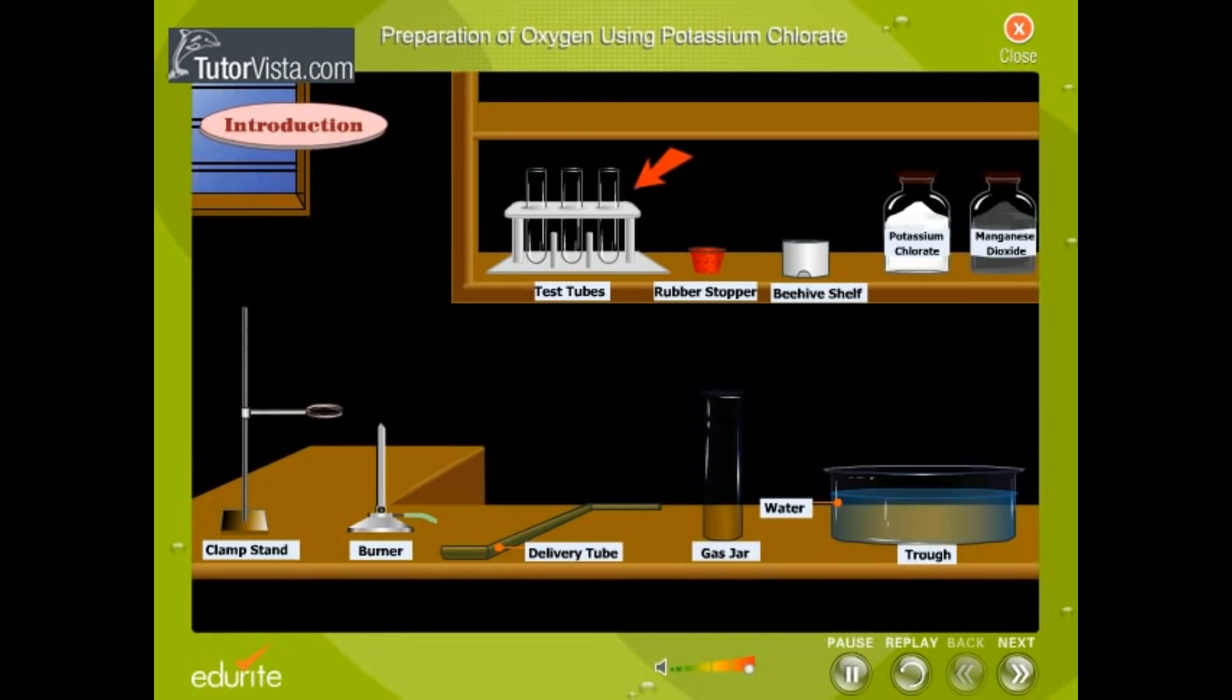You will need: hard glass test tube, gas jar, trough, delivery tube, one-hole rubber stopper, clamp stand, burner, beehive shelf, water, potassium chlorate, and manganese dioxide.